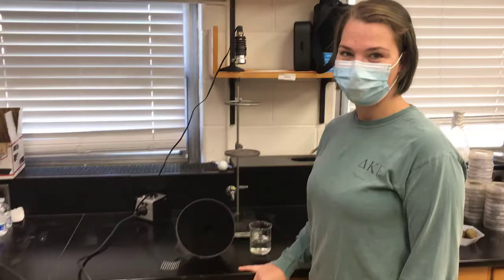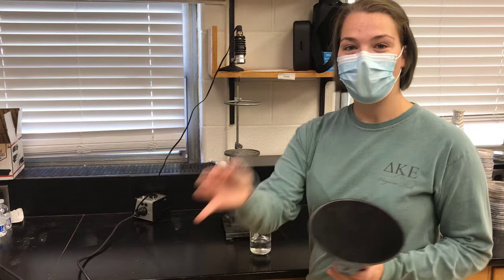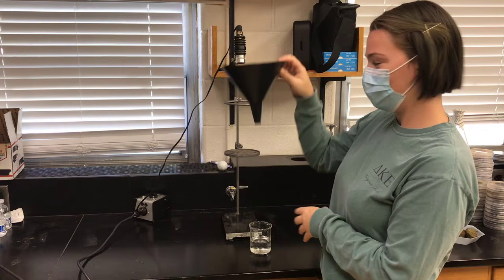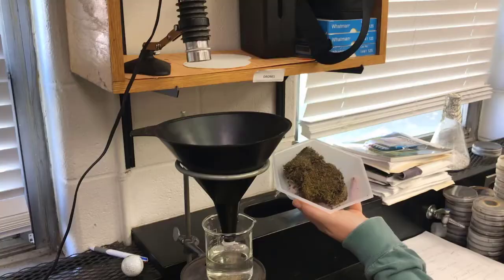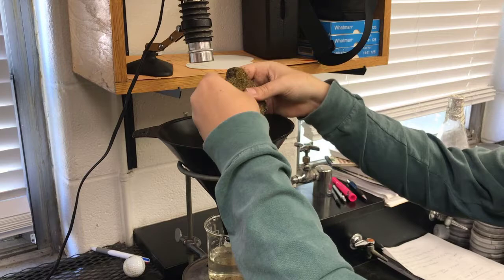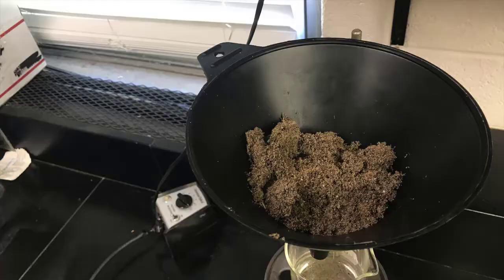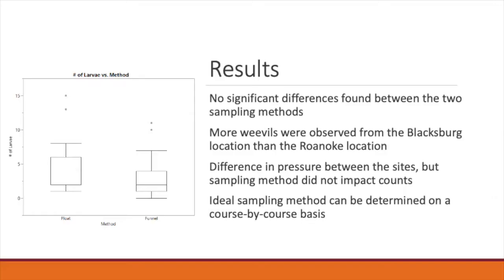Now let's set up our Berlese-Tullgren funnel method. First, take your funnel — I used about a one-pint funnel, but any size is relatively fine. Then take your piece of wire mesh and place it over the hole of your funnel, pushing the sides in to form to the contour of the funnel. Next, place your funnel, then take your catch jar filled with some water and place it underneath. All of this should be underneath the heat lamp. Then take your plugs and break them up like the salt float plugs, but into smaller pieces, because the Berlese funnel works when the heat source forces the arthropods to move toward moisture in the catch jar. Turn on your light or heat source and allow the plugs to sit for 48 hours.